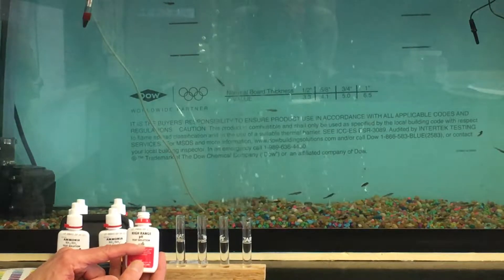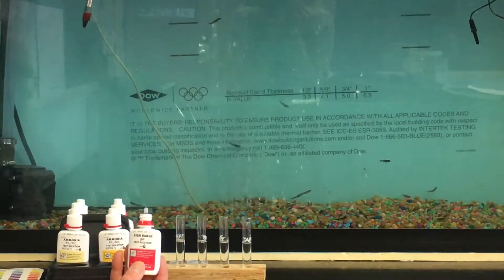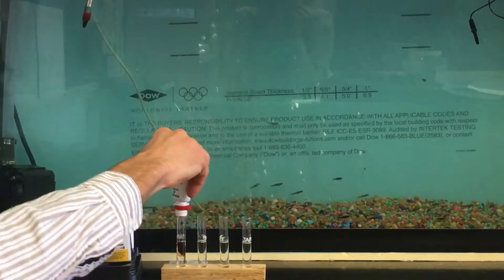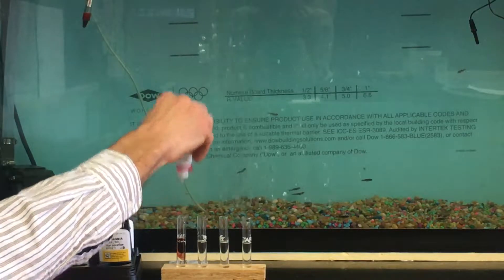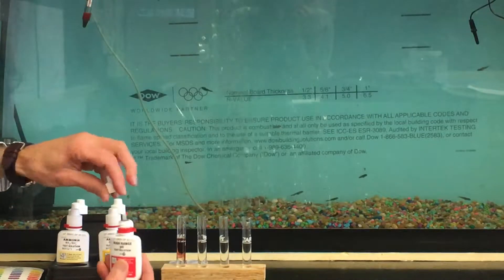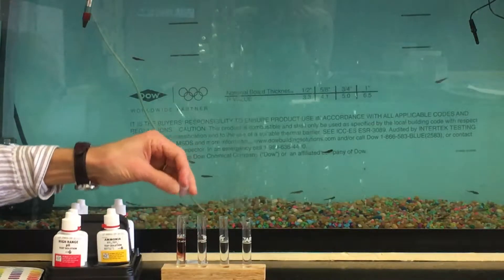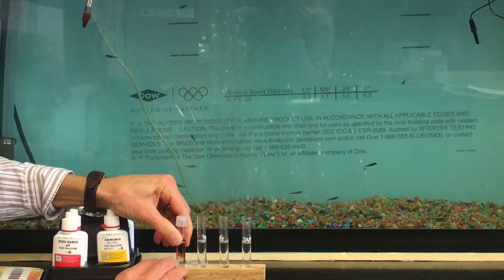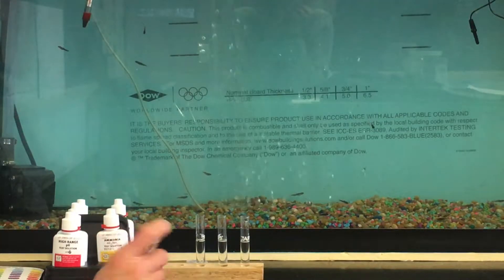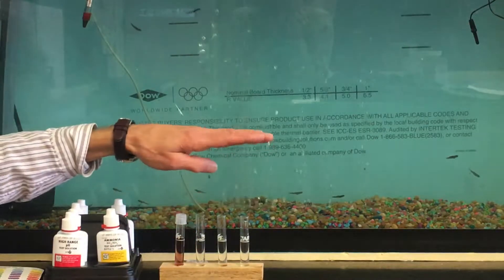It's best to hold the bottle straight up and down right on top of the test tube and count out the number of drops. The number needed is printed on the front of the bottle in a little black drop. For the high range pH test, it's five drops: one, two, three, four, five. Lift it straight up to avoid a drop running down the side. Cap it, put it back in the holder, cover with the plastic cap, and agitate for about five seconds.